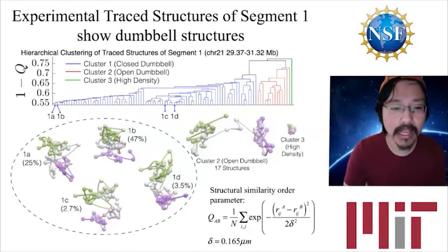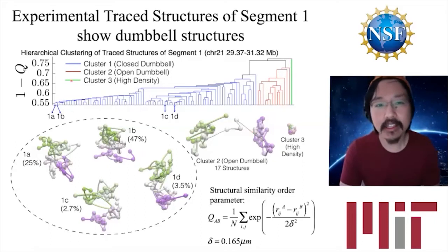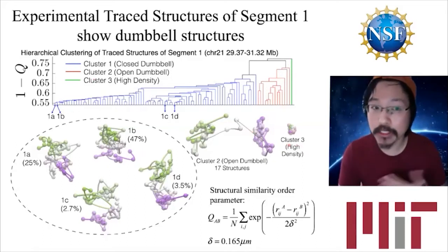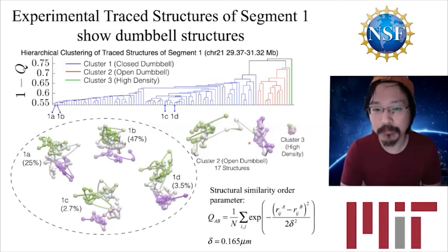And the globular domains are shown here in greenish, yellow, and purple. And so cluster 2, we refer to as an open dumbbell, where the globular domains have come far apart from one another. And we have cluster 3, which we believe to be an experimental artifact that accounts for only about 1% of the experimental data. And so we focus mainly on clusters 1 and 2, the closed and the open dumbbell.